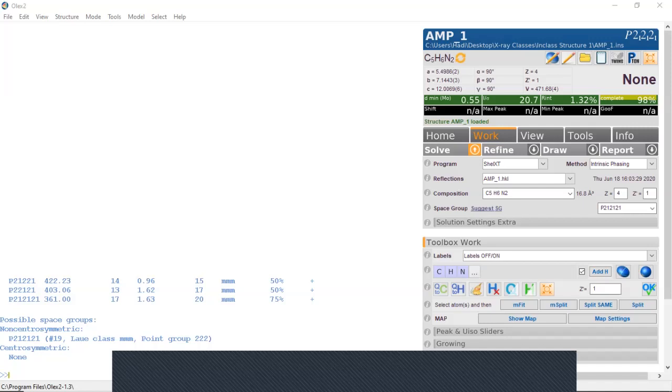And this is just like a Christmas tree. Whenever you see things light up in green, that means they're good. Dark green is perfect, light green is good, orange or yellow is okay, and red is not good. If you have something in red, that's a serious problem in your structure. Right now they're all green. Here we have the lattice parameters.